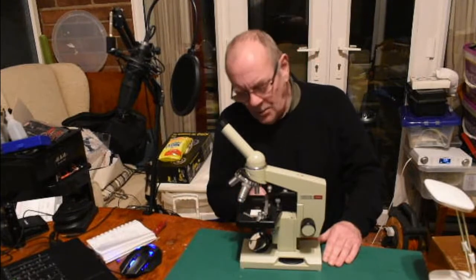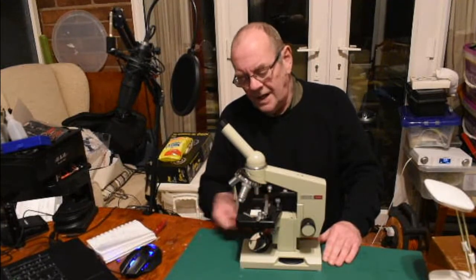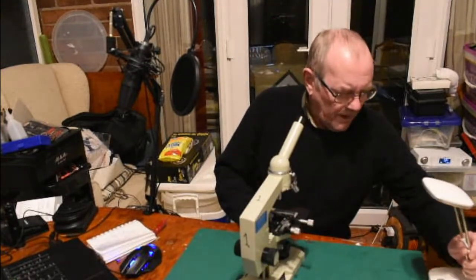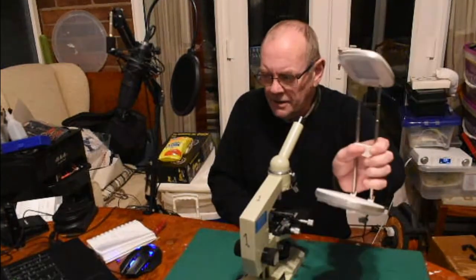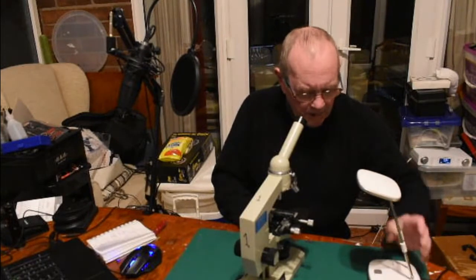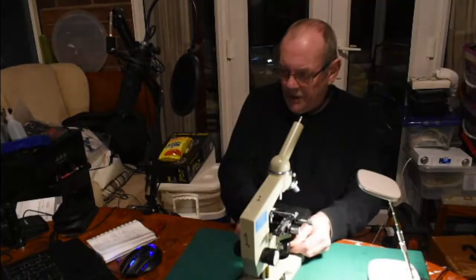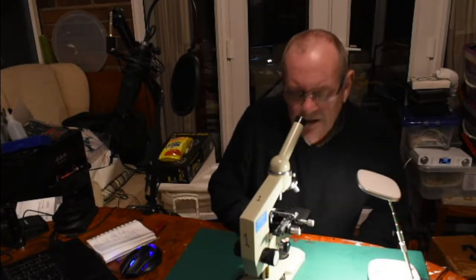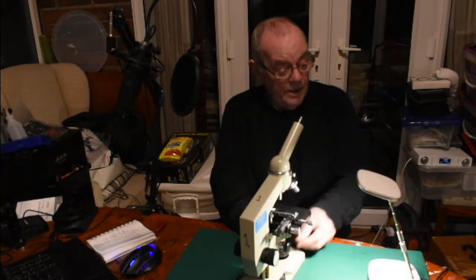As far as the light source is concerned, ideally you'd have an LED light source underneath to just switch on, but this didn't come with one. So what I've got is a small LED table — you can see there's a little table lamp — which I switch on and direct the light onto the mirror, and it's perfect, really really good.